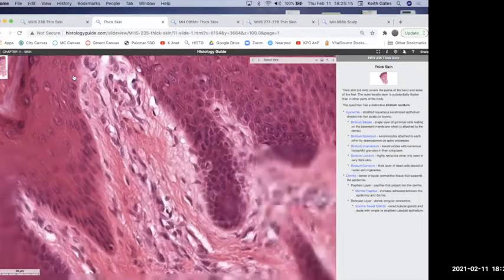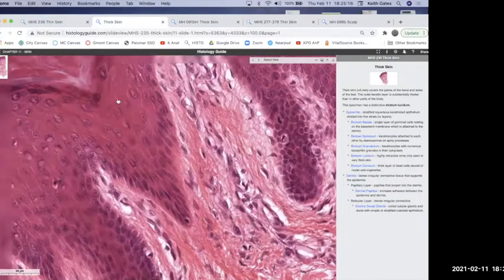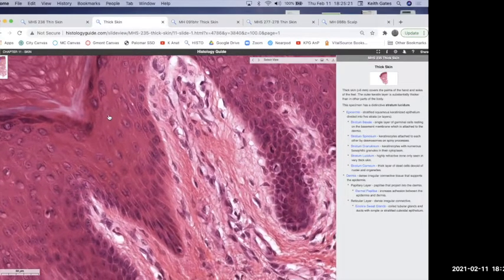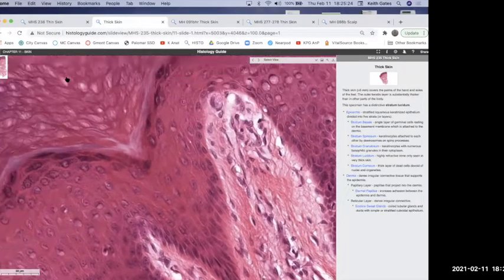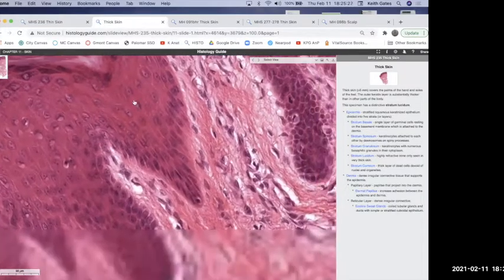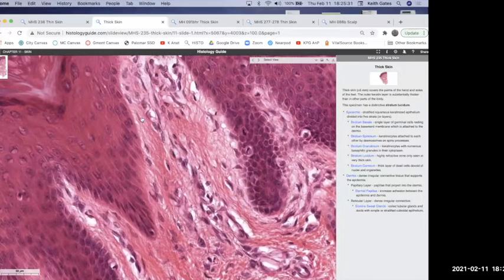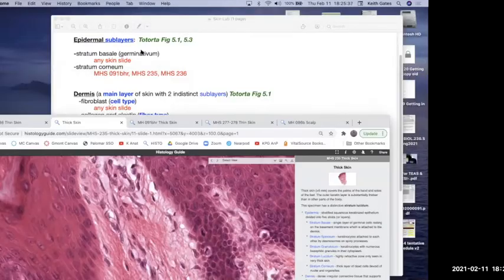Right, it's not this part, by the way. This is just different distinct layers of the epidermis. I didn't go over these, and you don't have to identify them, but it's going to change from epithelial layer to connective tissue under it. Okay, and then this would be the stratum basale. All right, and that's these. I believe that's all those, right?